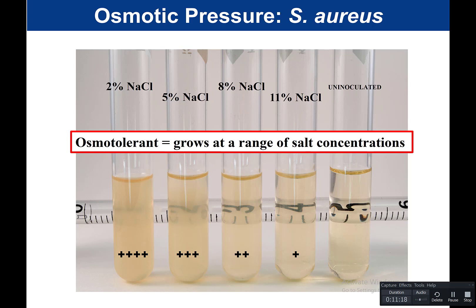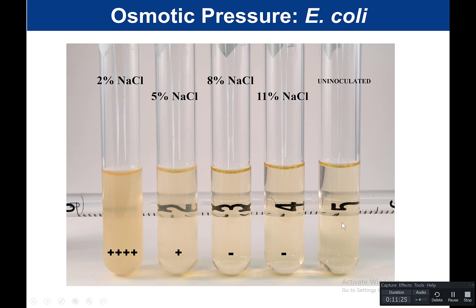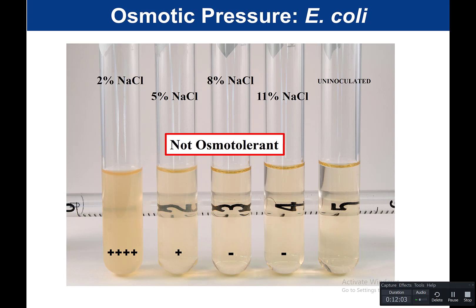For E. coli, here is our uninoculated control. At 11% salt, no growth. At 8% salt, no growth. At 5% salt, very little growth — I would quantitate this as 1+. But at 2% salt, it grew very well, so 4+. For E. coli, it grew at 2% salt and a tiny bit at 5%, but not at 8% or 11%, which tells us that this bacteria is not osmotolerant. It is not able to tolerate changes in osmotic pressure or high salt concentrations.